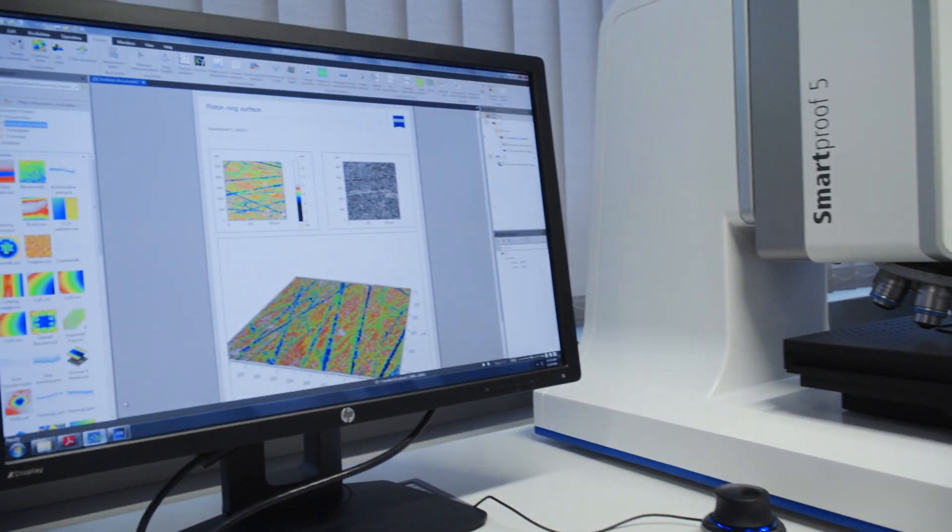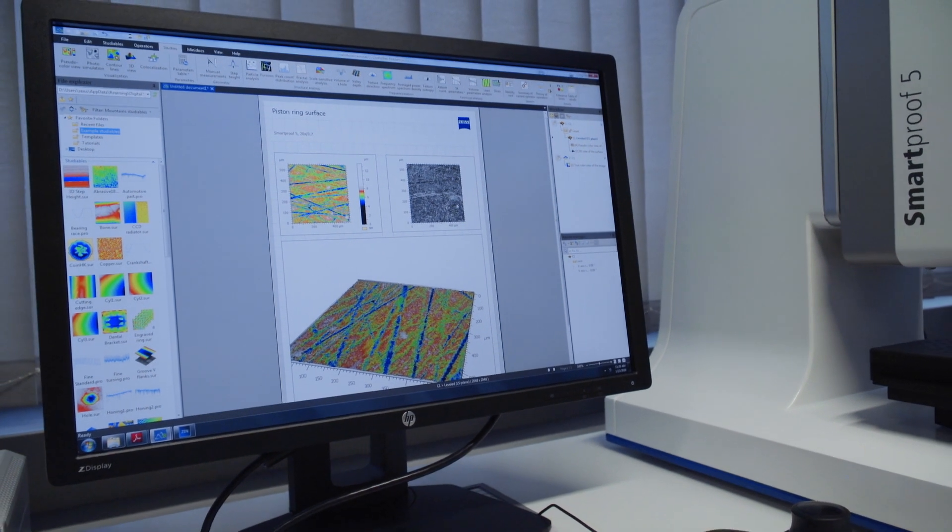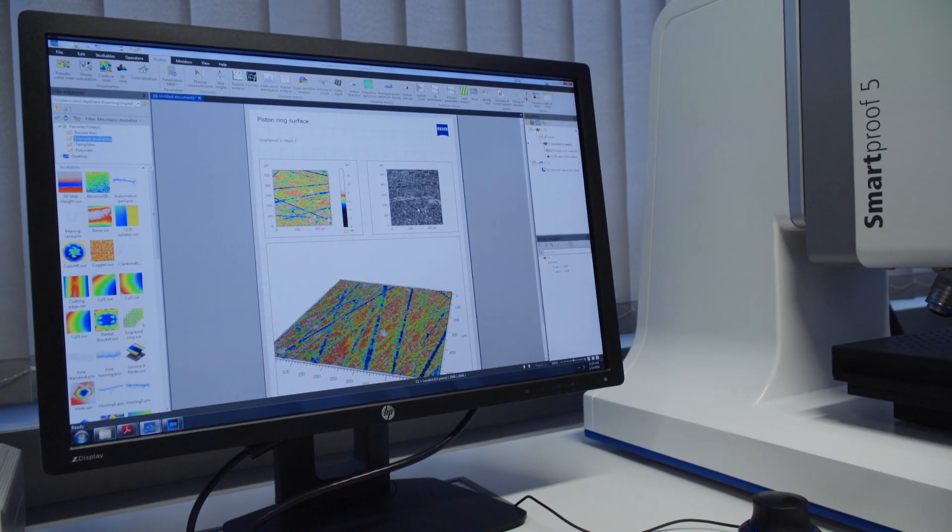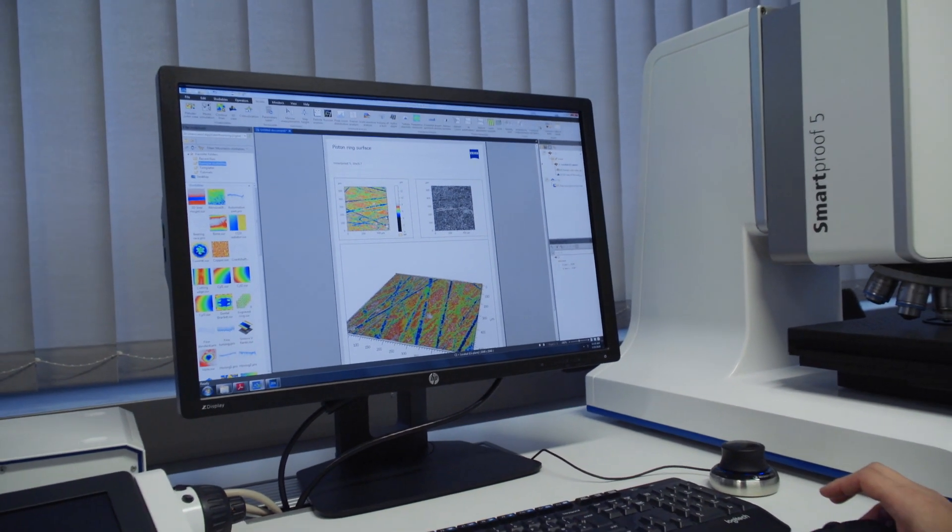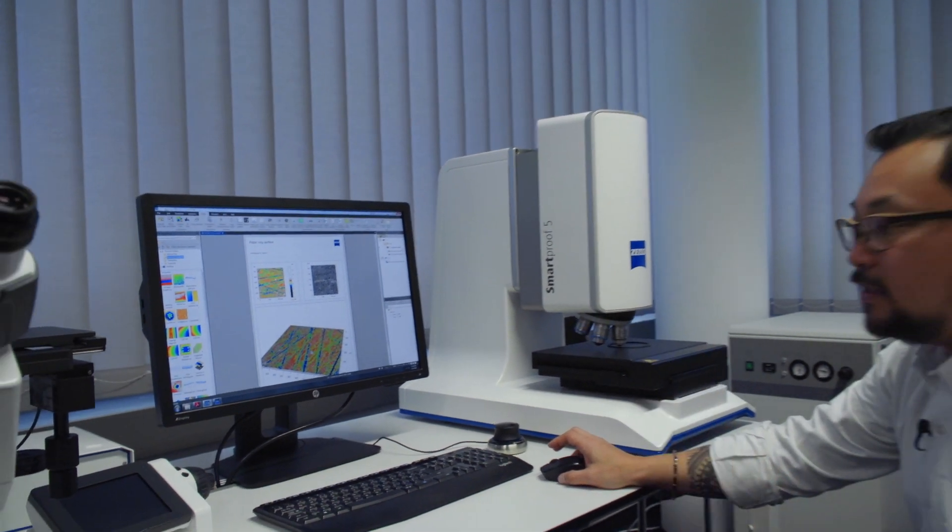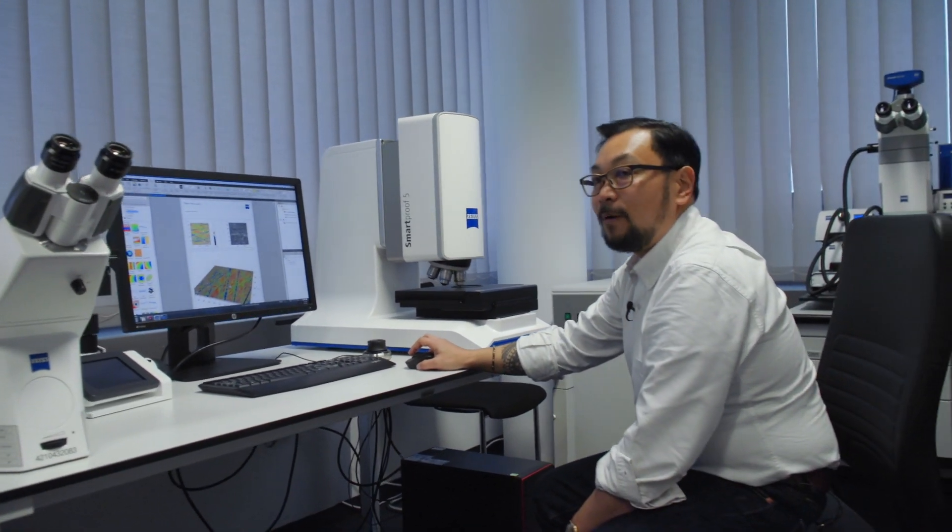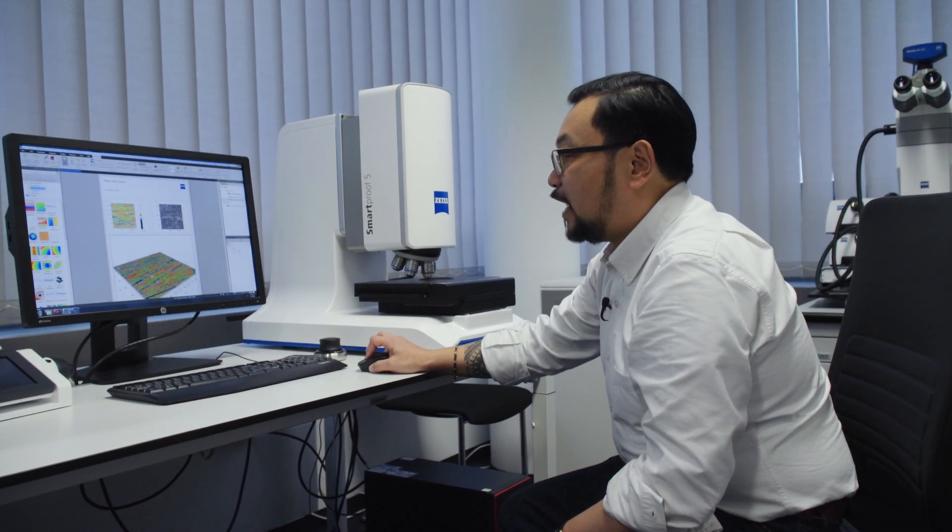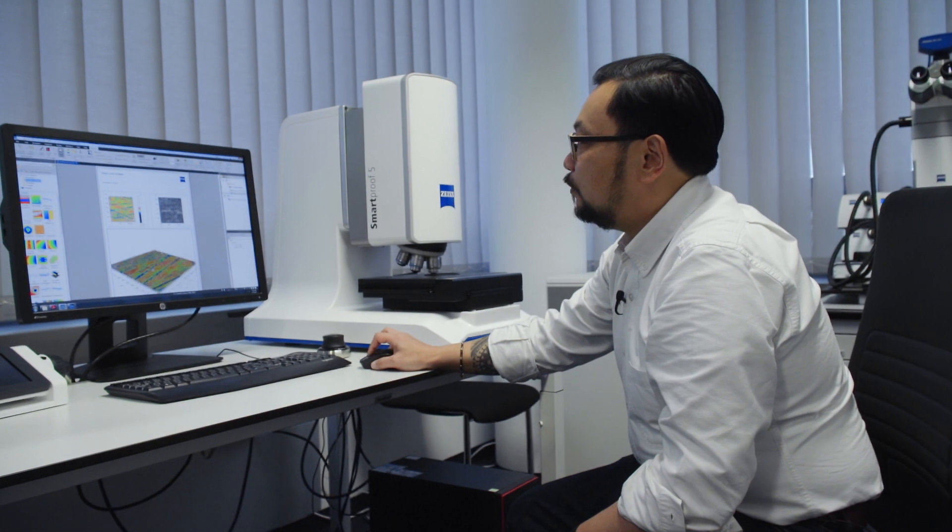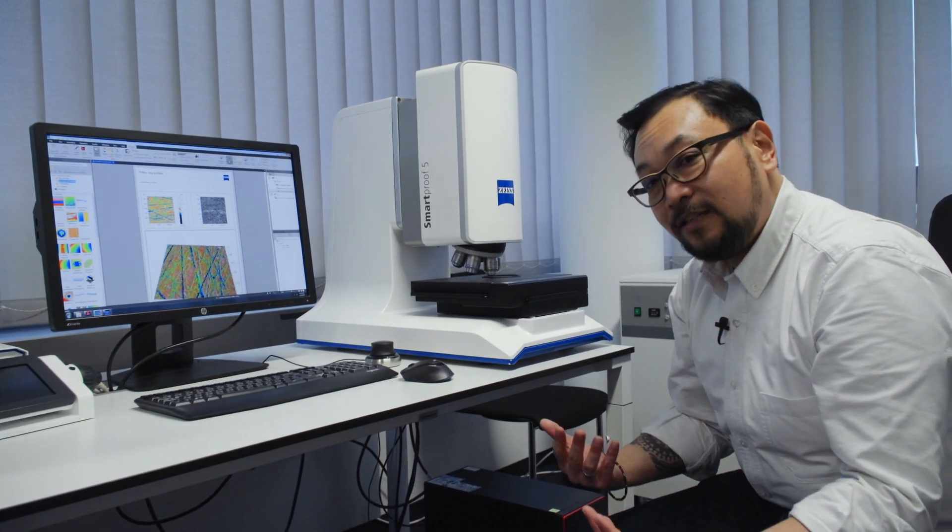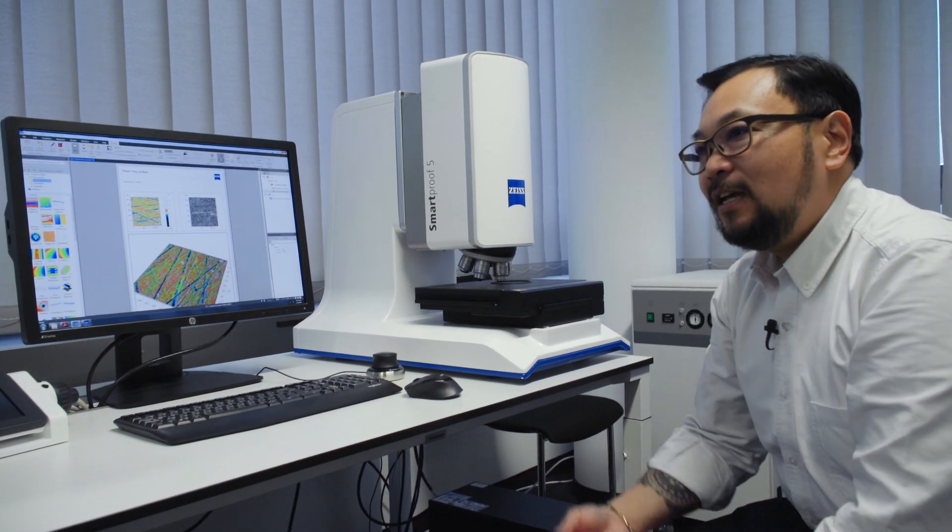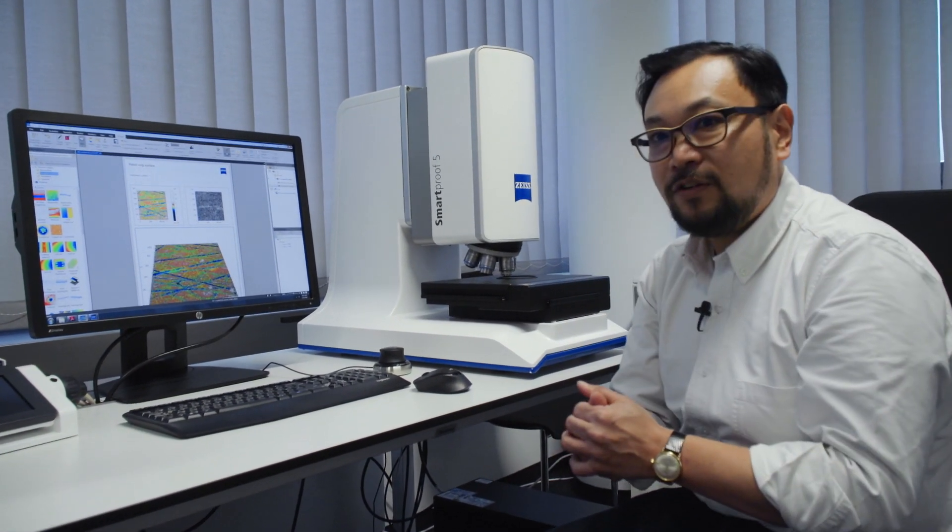So here we can see we have this surface texture image in black and white and then what we've done is we've color mapped it based on peaks and valleys so you can get a very interesting representation of that using color. Down here we have a fully isometric view that we can have a look around. We can even automate it in the report.